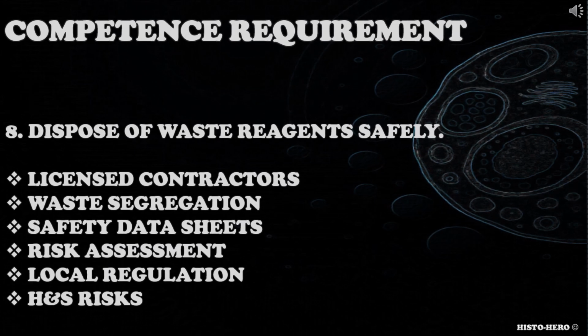The eighth competence requirement is for you to dispose of waste reagents safely. How do you dispose safely reagents used during relevant demonstration methods? What disposal risks are associated with those reagents?